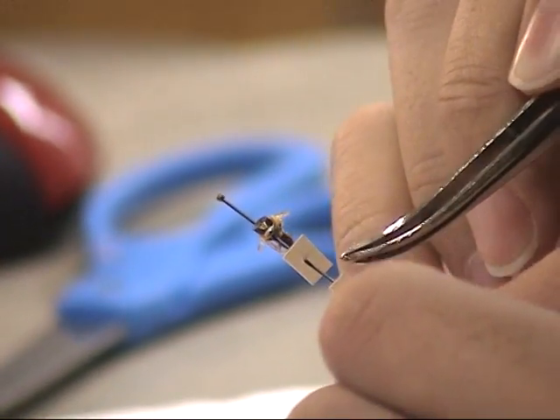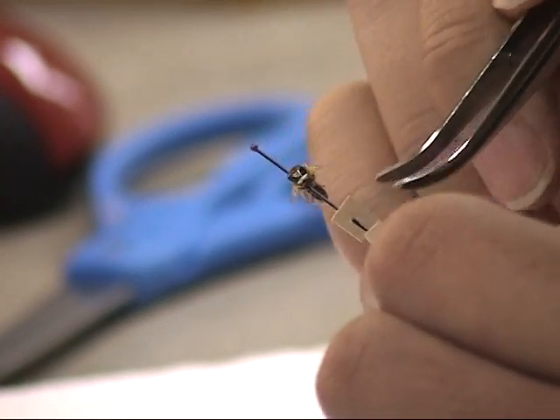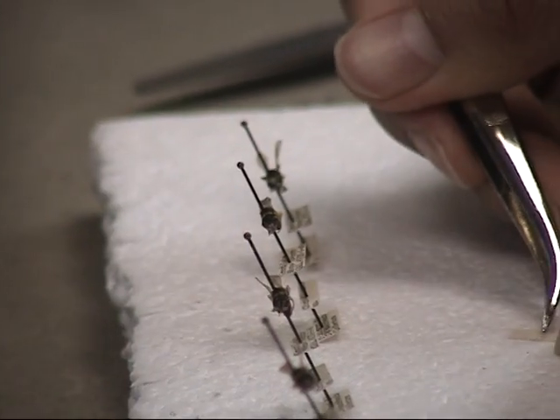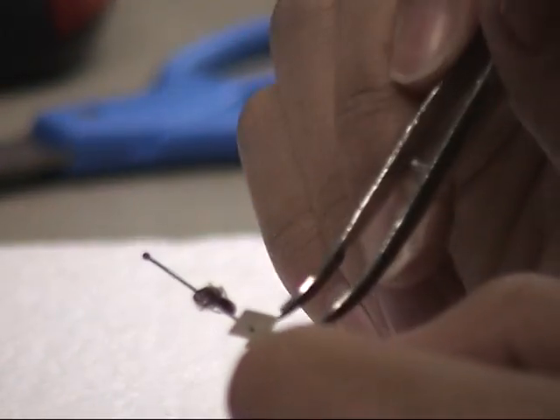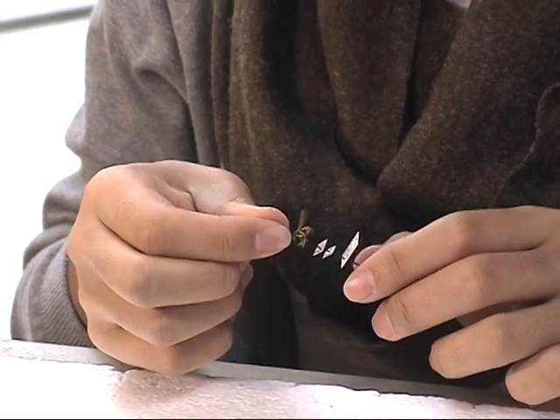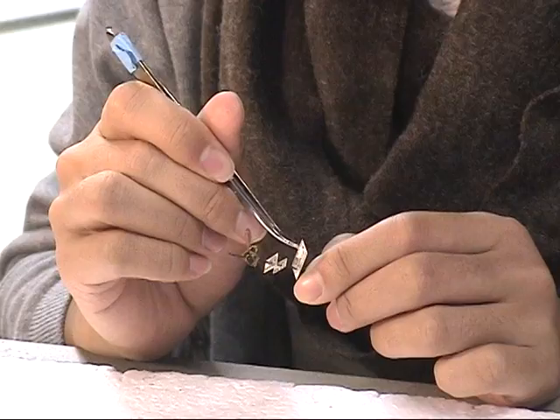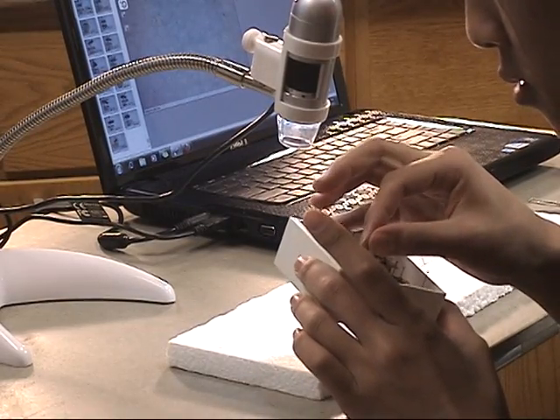Insect specimens may be up to 100 years old or more and are extremely fragile. CalBug aims to efficiently capture the information accompanying specimens while maintaining specimen quality so that researchers may use them up to the next 100 years. Handle each specimen from the top of the pin, taking care not to touch any part of the specimen.